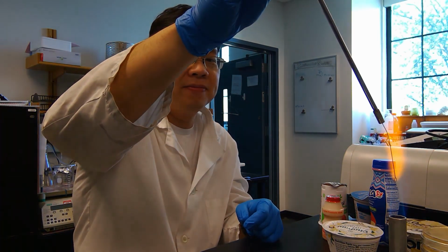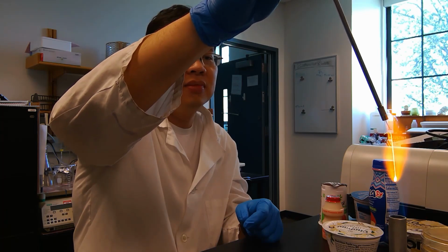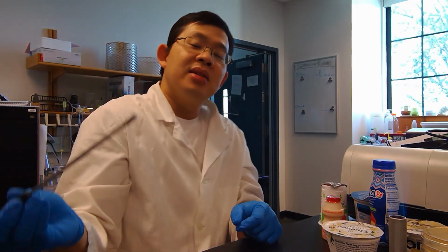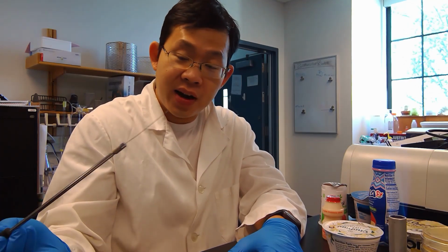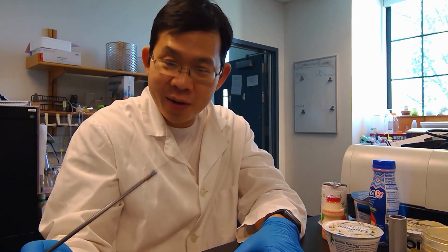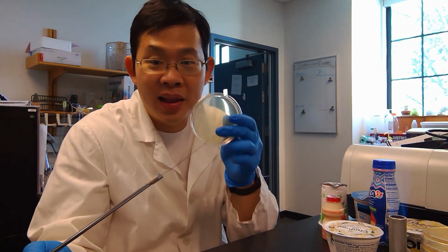There you go. Okay, now it's red hot. This is very hot, and it's sterile. Now it is very, very hot, and if it's too hot for you, it's most likely too hot for your poor bacteria also.